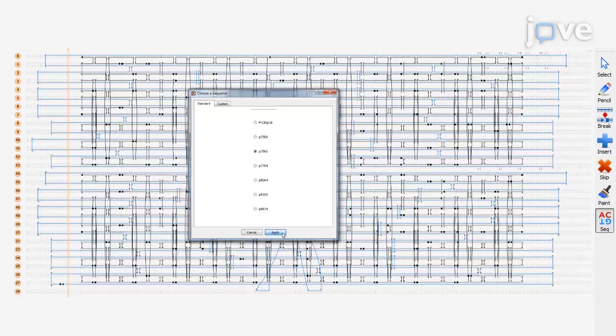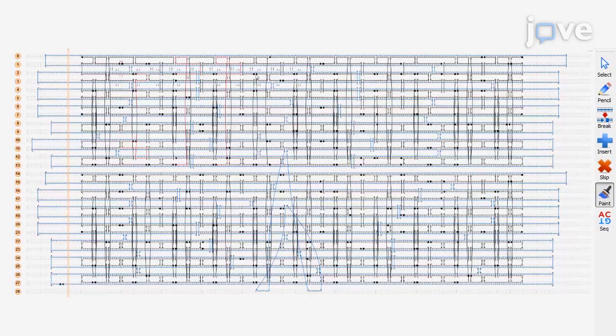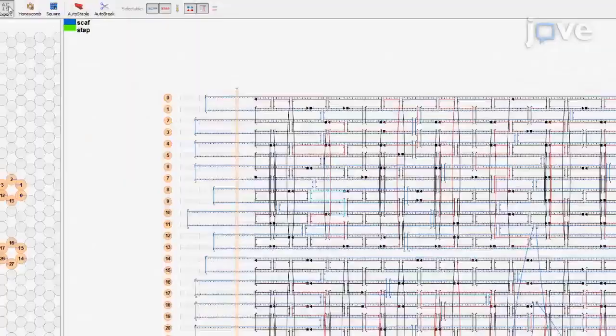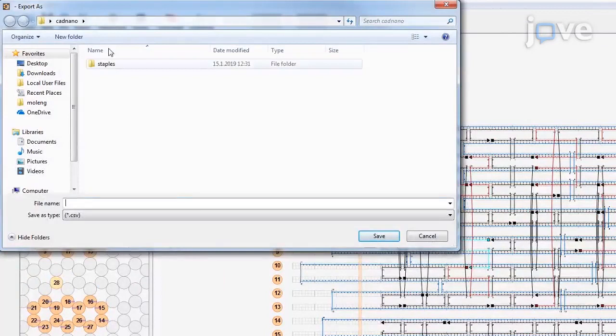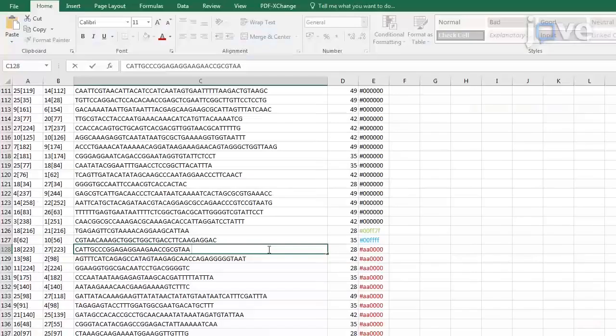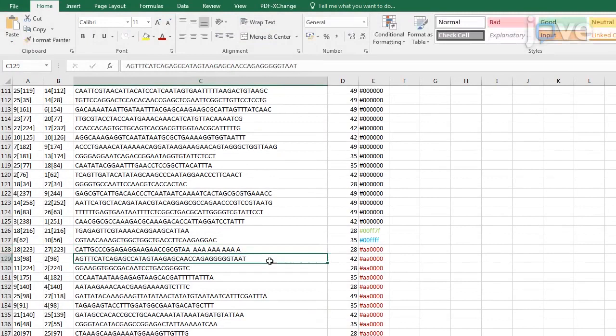Click Paint tool and mark the staple strands that require further modification. Click Export tool to export the DNA staple sequences to a CSV file. Then import the CSV file into a spreadsheet application.